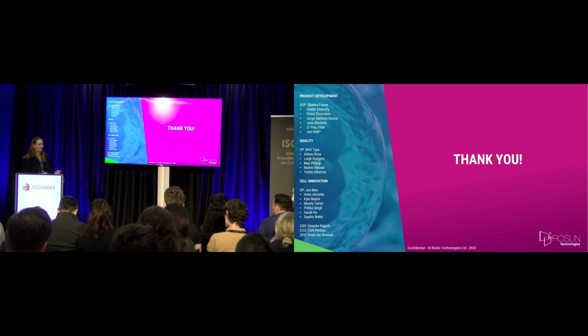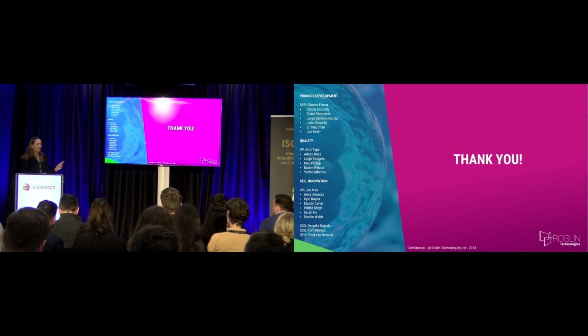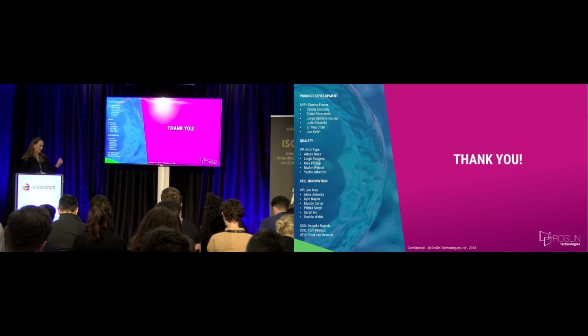So from a seed train perspective, because we work at small scale, we model that by going from 3 milliliters to 40 milliliters in 100 ml flasks to the 400, 500 ml in a reactor up to a 3 liter. So we monitor it from beginning to end through that point of view. The largest scale that I showed here didn't go through the full cycle. It was a T flask that went into a 500 ml that went into a 3 liter. So that information is captured. The passage that I show starts when it first goes into suspension. Okay, thank you.